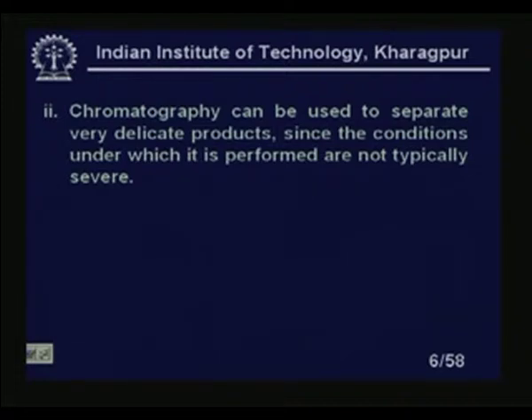Very delicate products also, that means the temperature is not very severe. Temperatures, moistures, everything is not very extreme. So, at normal room temperature you can do it. That is the reason very delicate compounds, very delicate complexes of gases, all those things can be nicely separated in this particular system.